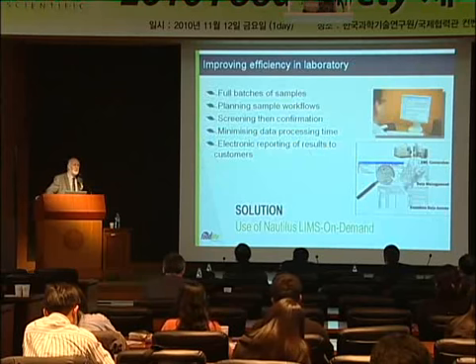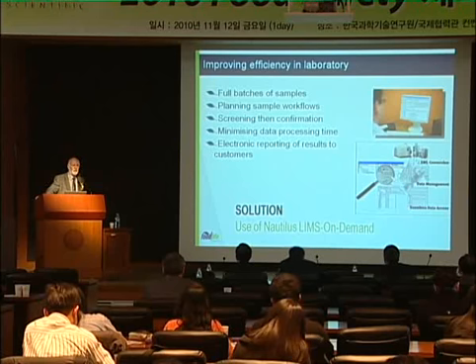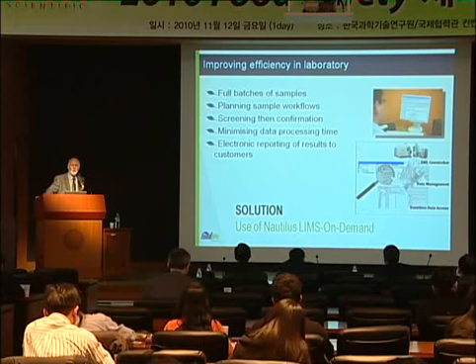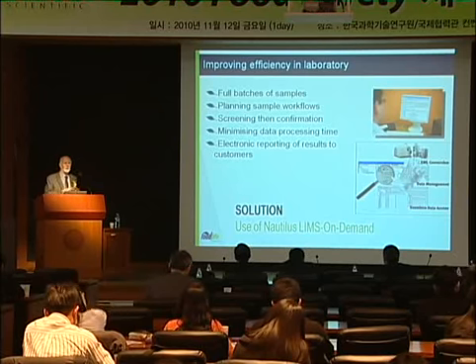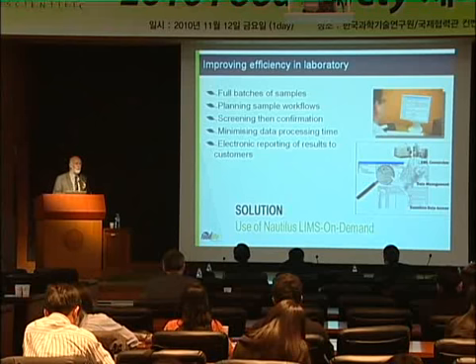The processes in food testing laboratories have become very, very complex these days. A typical laboratory will receive large numbers of samples every day. Different samples require to go to different points in the laboratory. They perhaps come in during different times during the day. Managing this is a complicated process.